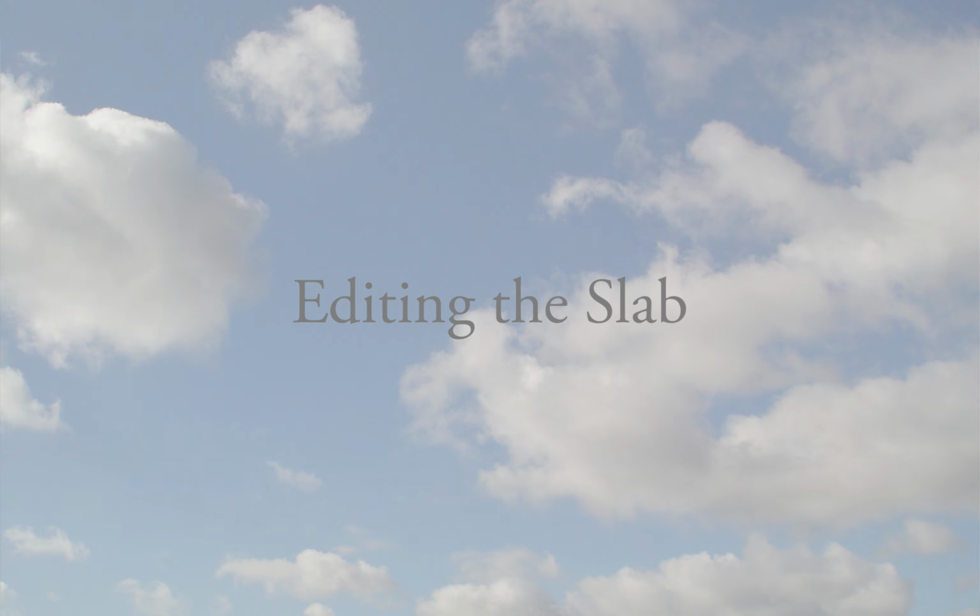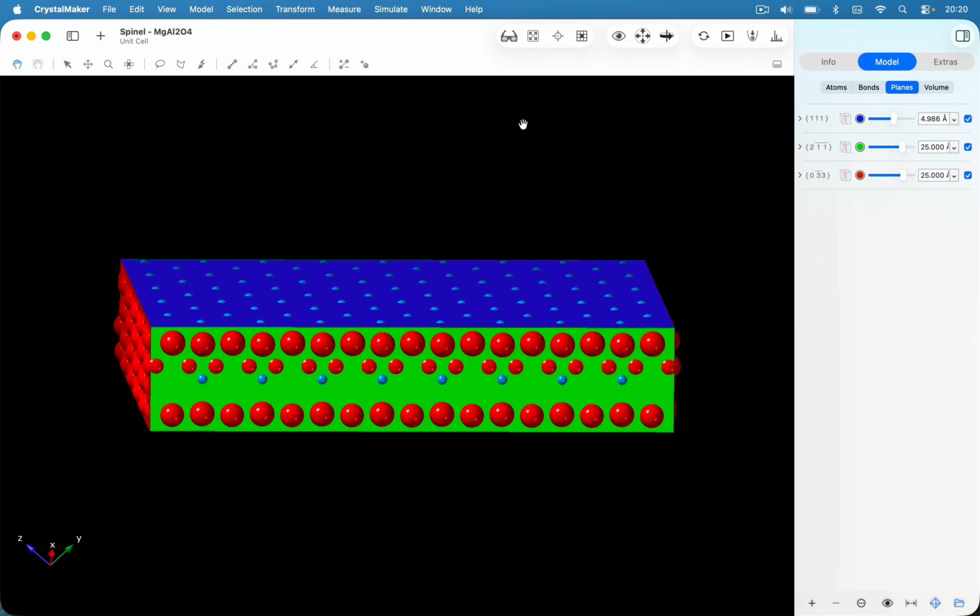Now, what happens if we want to change the thickness of the slab? We could run the command again, specifying a different thickness and possibly a different diameter, or we can edit it by moving these planes in the Planes Inspector. And you'll find more details about how to use the Planes Inspector in our tutorials on crystal shapes. But let's have a go now.